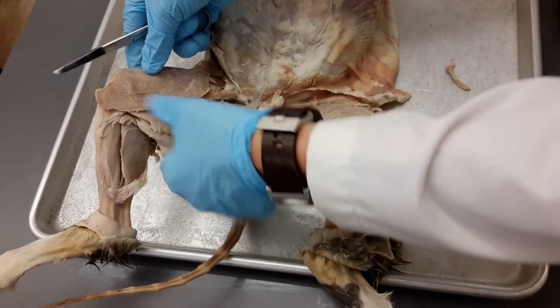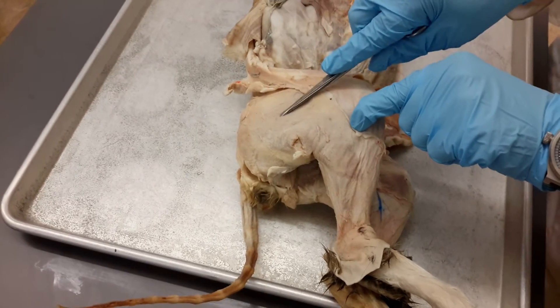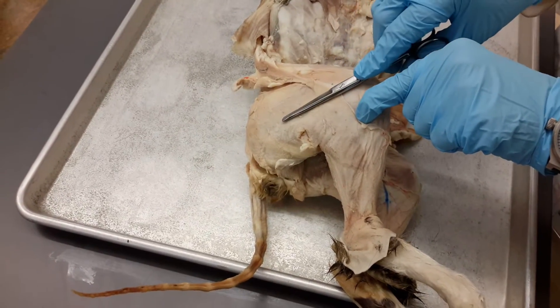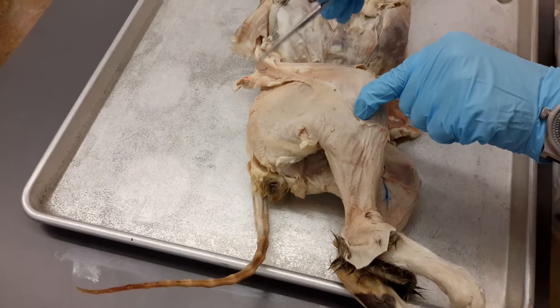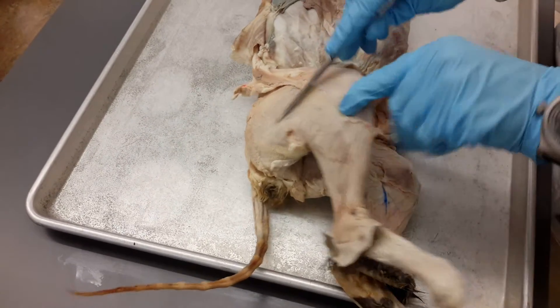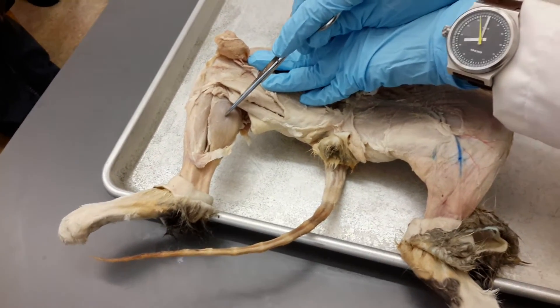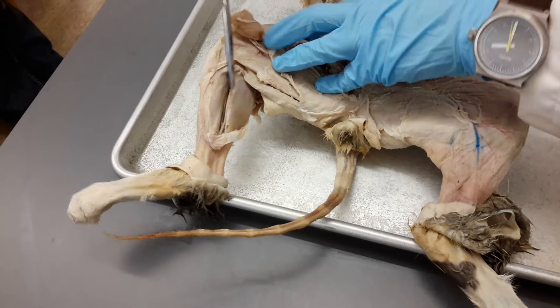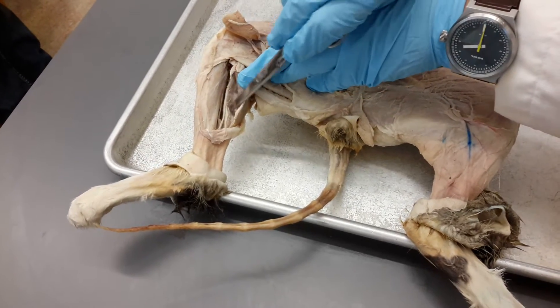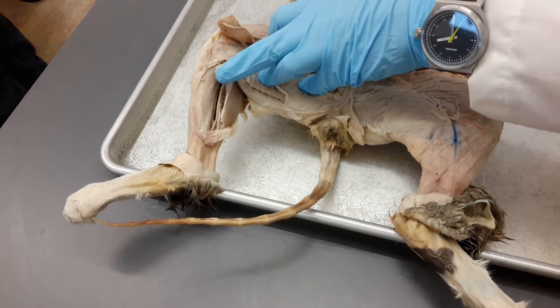The biceps femoris is just on the back here, so that really didn't require any dissection — it almost looks like the cat's butt. Biceps femoris. We did the calf muscles, right? This is the gastrocnemius. Underneath the gastrocnemius is the soleus.